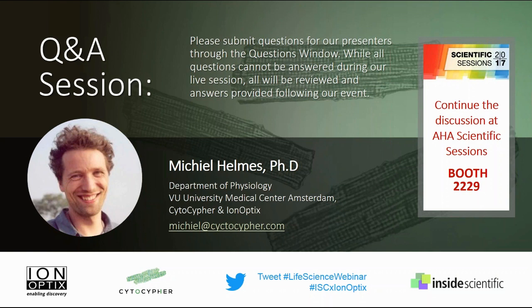Very good. Any final thoughts, Joe, on that? No, I think Michael was pretty clear. The experiment setup is similar to the existing IonOptix software, IonWizard. You can define the duration of the experiments. There are new features that allow you to loop, so you can loop back to various epochs, if you're familiar with the software, and that's simply the duration of acquisition for each cell. There's actually more functionality coming to make it even more expandable and more flexible.